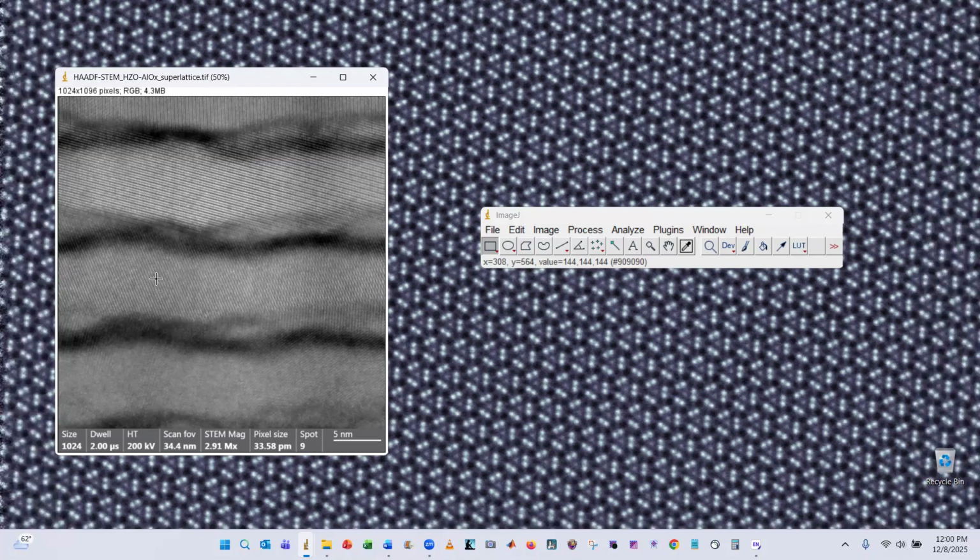It doesn't have to be square. It doesn't have to be power of two dimensions. I'll show you how. The image that you calculate the FFT from has to be power of two dimensions, but the area doesn't have to be. I'm going to show you why in a minute.